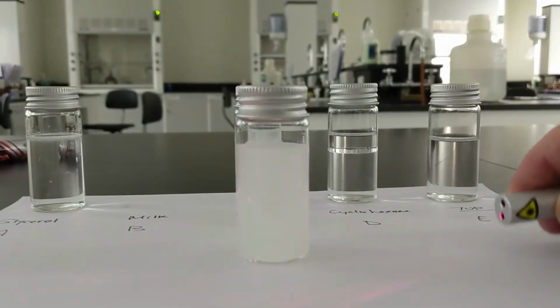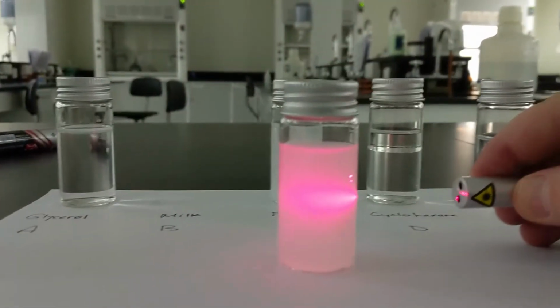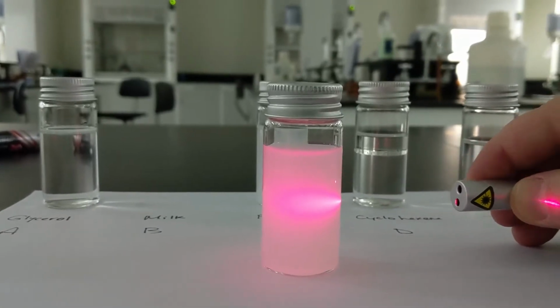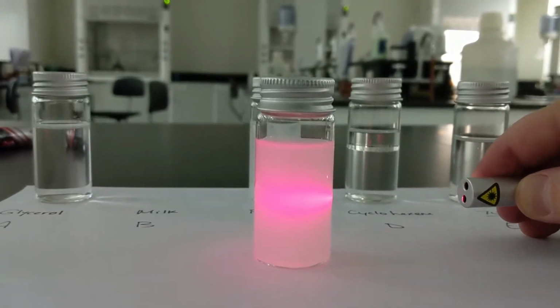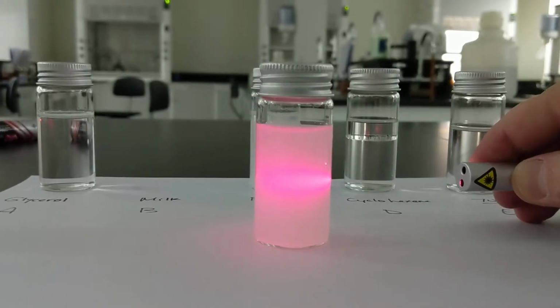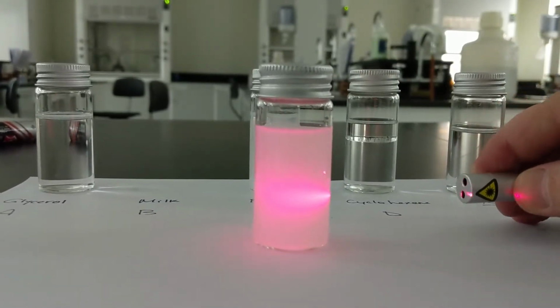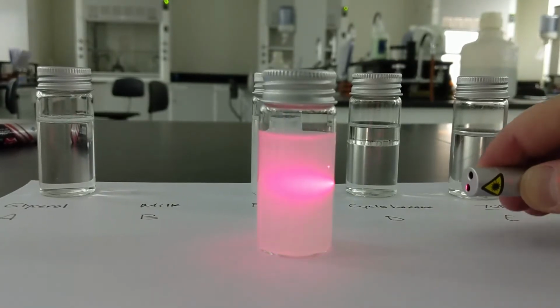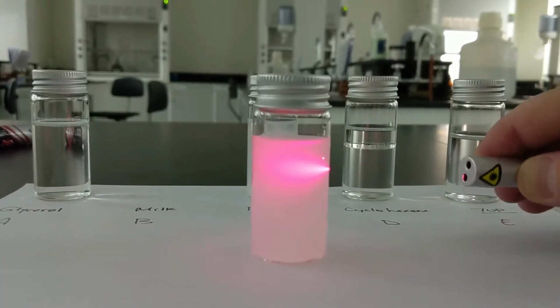All right, let's look at milk. You can see I've added a little bit more liquid to milk. Now, milk, this is the beauty of milk. Look at what the laser's doing. Not only is the laser shining through that solution, it's lighting up the whole solution. Look at that. There are so many particles here for the light to reflect or refract off of. So that's milk.